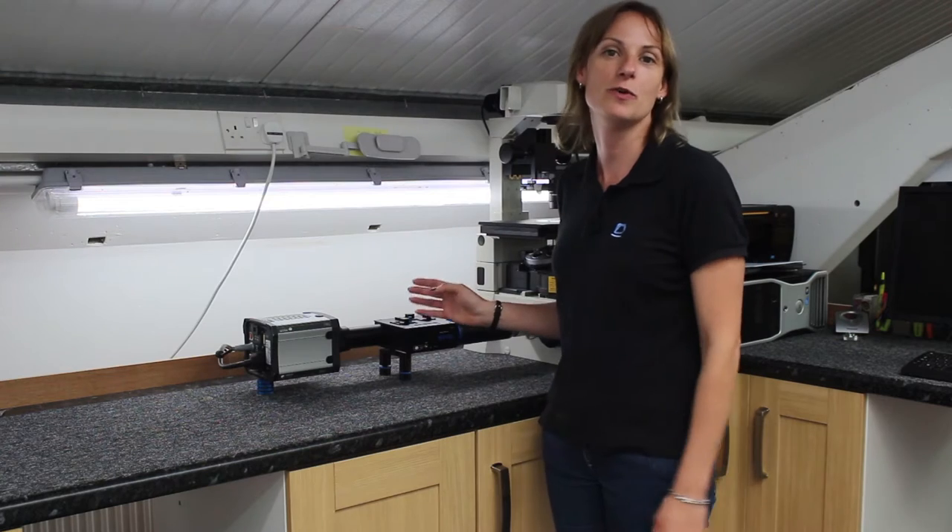Hi, I'm Linda Hall, I'm the Sales Manager here at Cairn Research. We're really excited to be launching a new product here at Physiology 2016 in Dublin. It's our OptiSplit 2 Bypass.